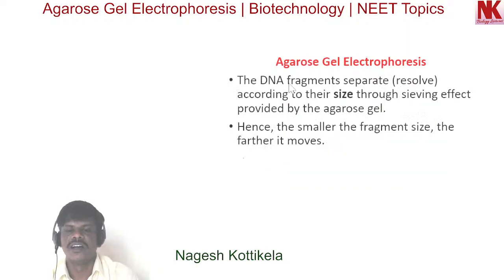Now here the DNA fragments separate or resolve according to their size through the sieving effect provided by the agarose gel. This is a very important statement for exams. I repeat this statement once again. The DNA fragments separate or resolve according to their size through the sieving effect provided by the agarose gel.